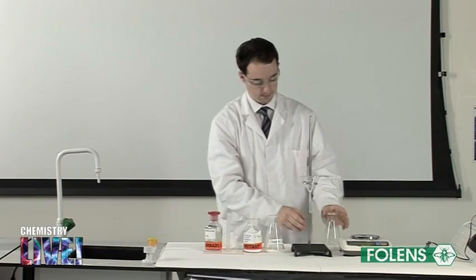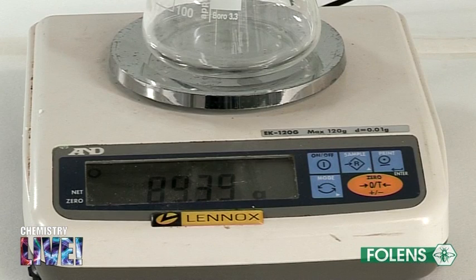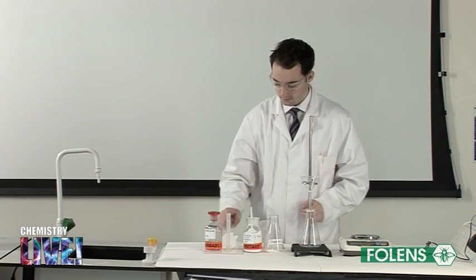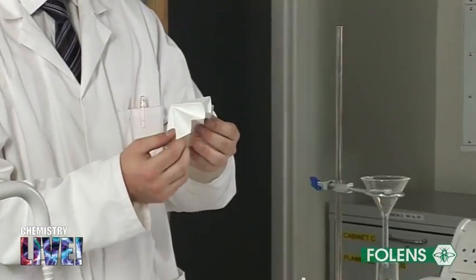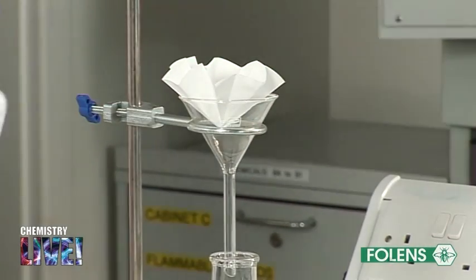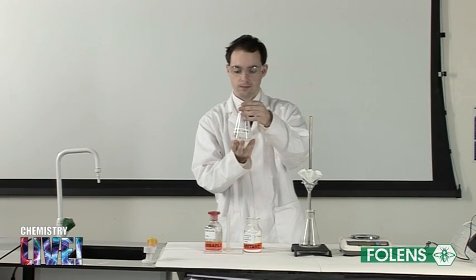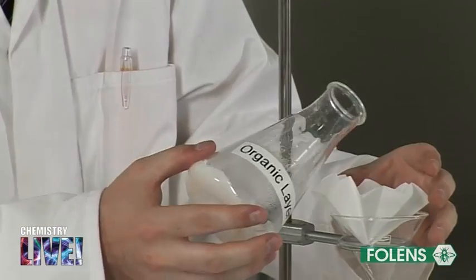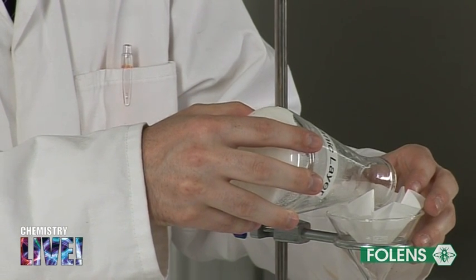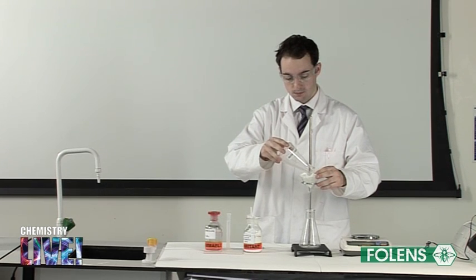Obtain a clean, dry conical flask and find its mass. The hydrated magnesium sulfate must now be removed. Place a fluted filter paper in a clean, dry funnel and place the funnel above the conical flask whose mass you've just measured. Pour the contents of the conical flask containing the oil of cloves, the cyclohexane, and magnesium sulfate into the fluted filter paper and allow the clear cyclohexane containing the oil of cloves to flow through the filter paper and into the pre-weighed conical flask.